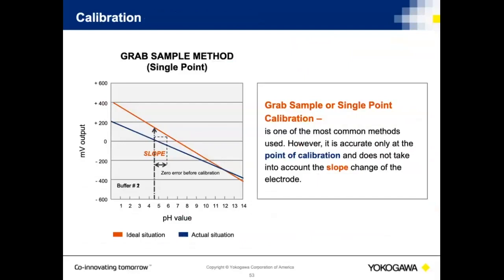So what we did as manufacturers is we basically set the calibration of the buffer solutions to give you precisely 4, 7, and 10 pHs. The key here is always make certain that you have the right buffer table programmed into the analyzer.